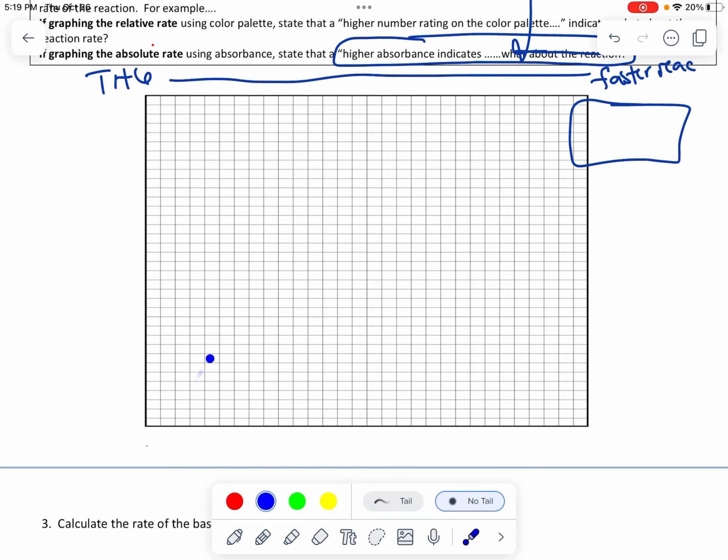Scale properly, and you should get a graph that increases, right? Some of you it increased, and you might have gotten to the point where enzyme and substrate were used up and it leveled out. You might have got to the Vmax. Some of you it's just going up.